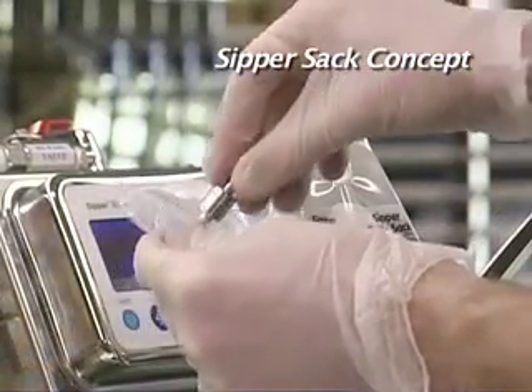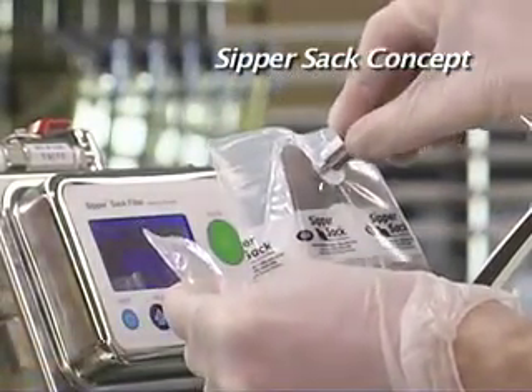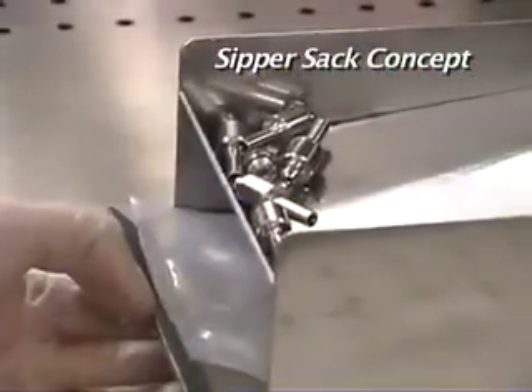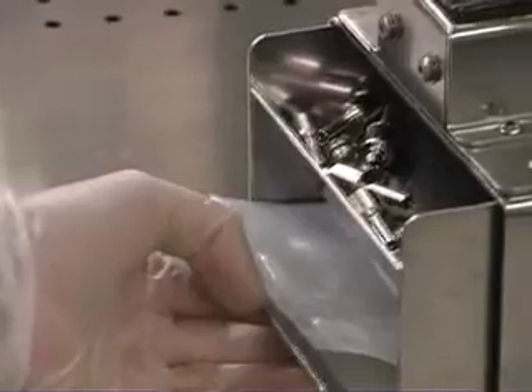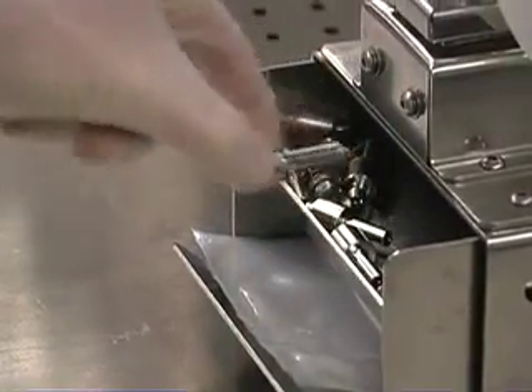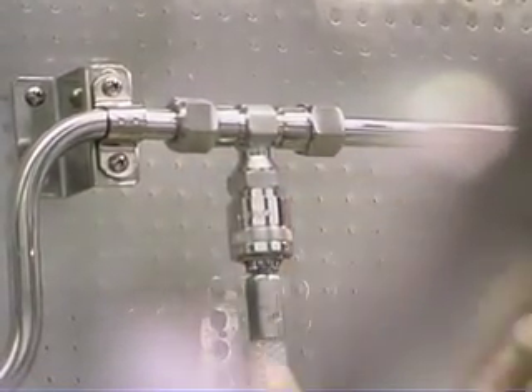When the Sippersack is empty, the stainless steel drinking valve can be reused and the empty Sippersack can be discarded. The sterile Sippersacks and drinking valves can be conveniently stored in the built-in tray minimizing hood space, and for smaller facilities the filler can easily be relocated to another room.